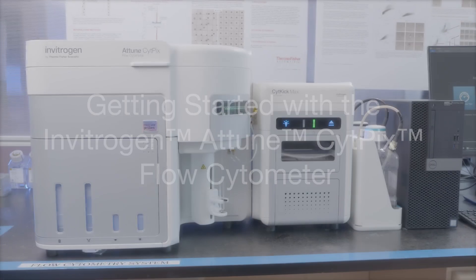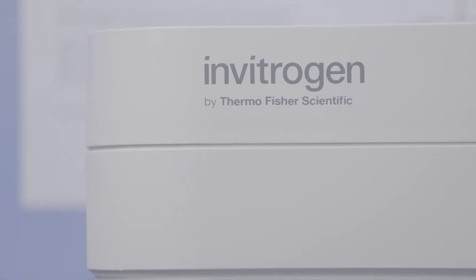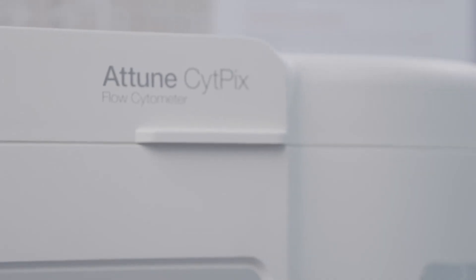In this video, we'll show you how to use the Invitrogen Attune CytPix flow cytometer.